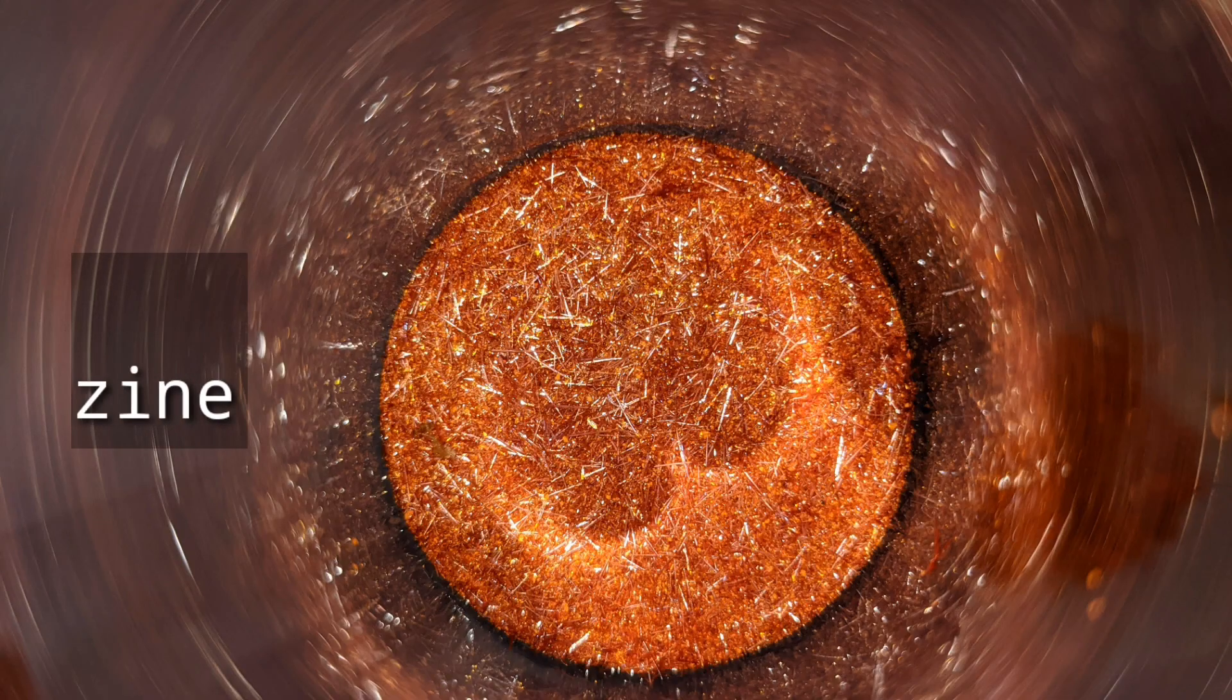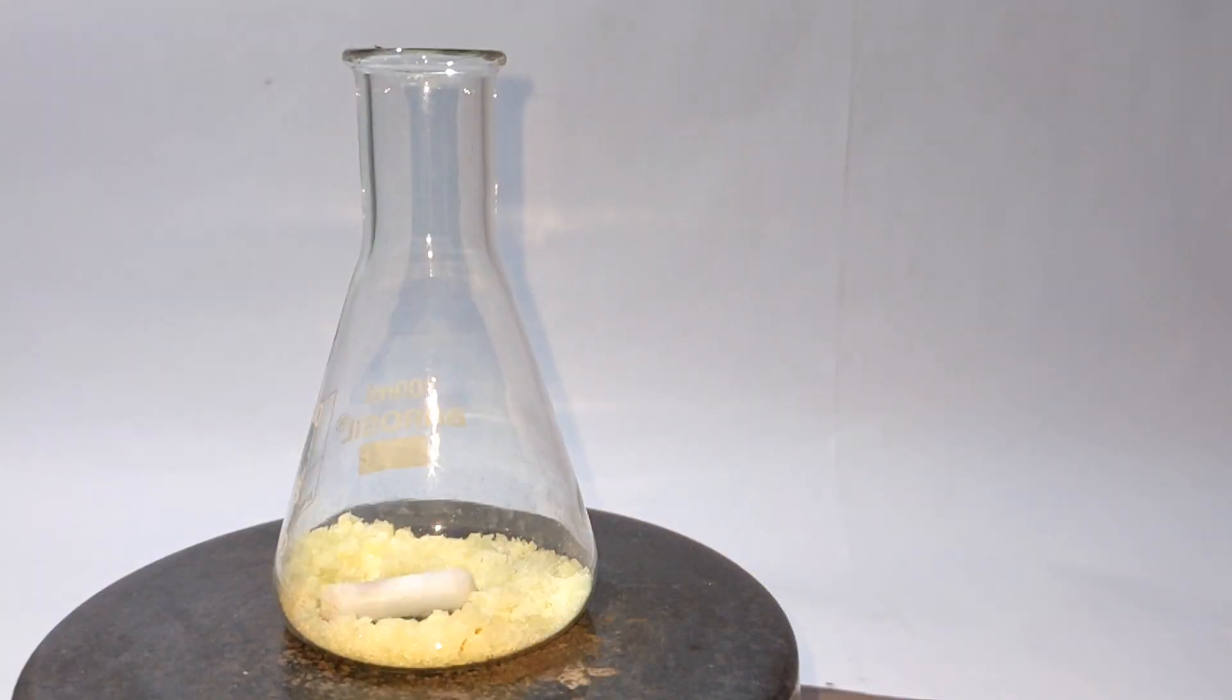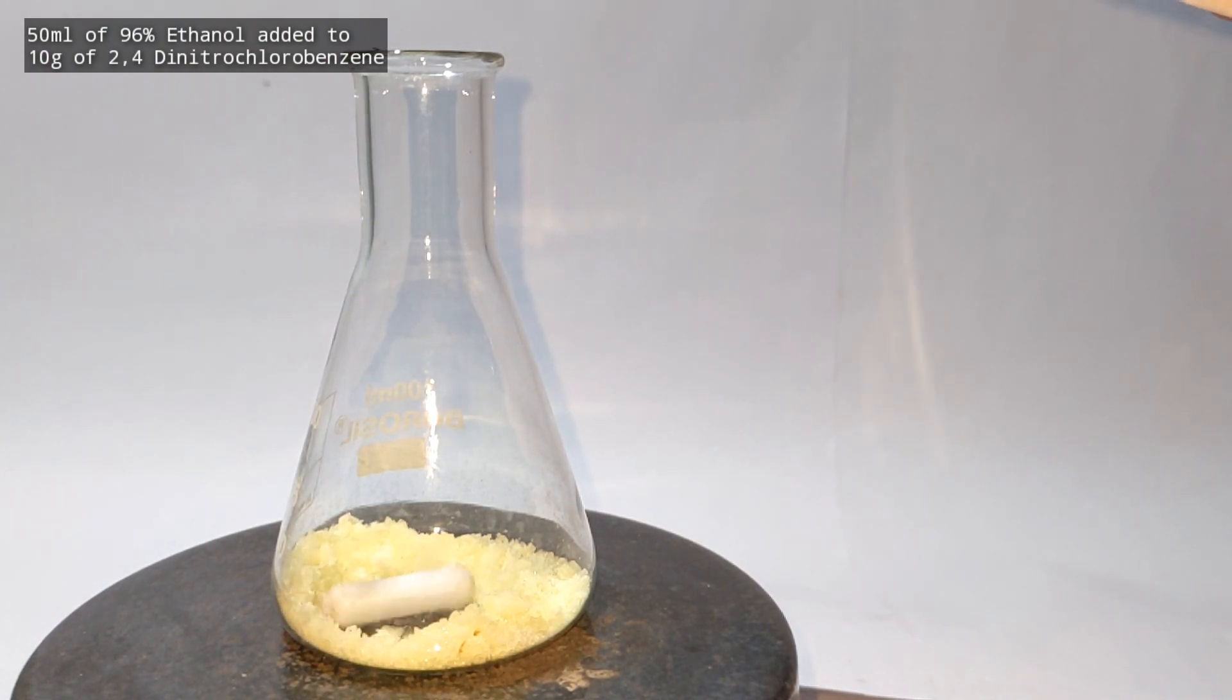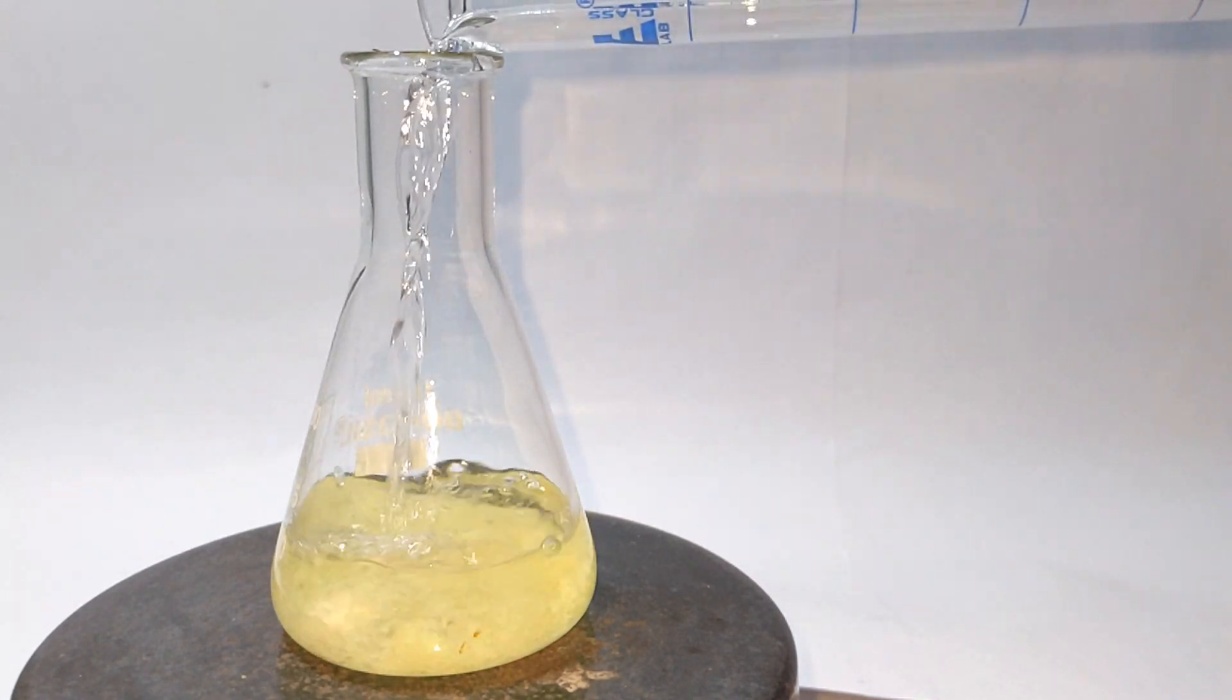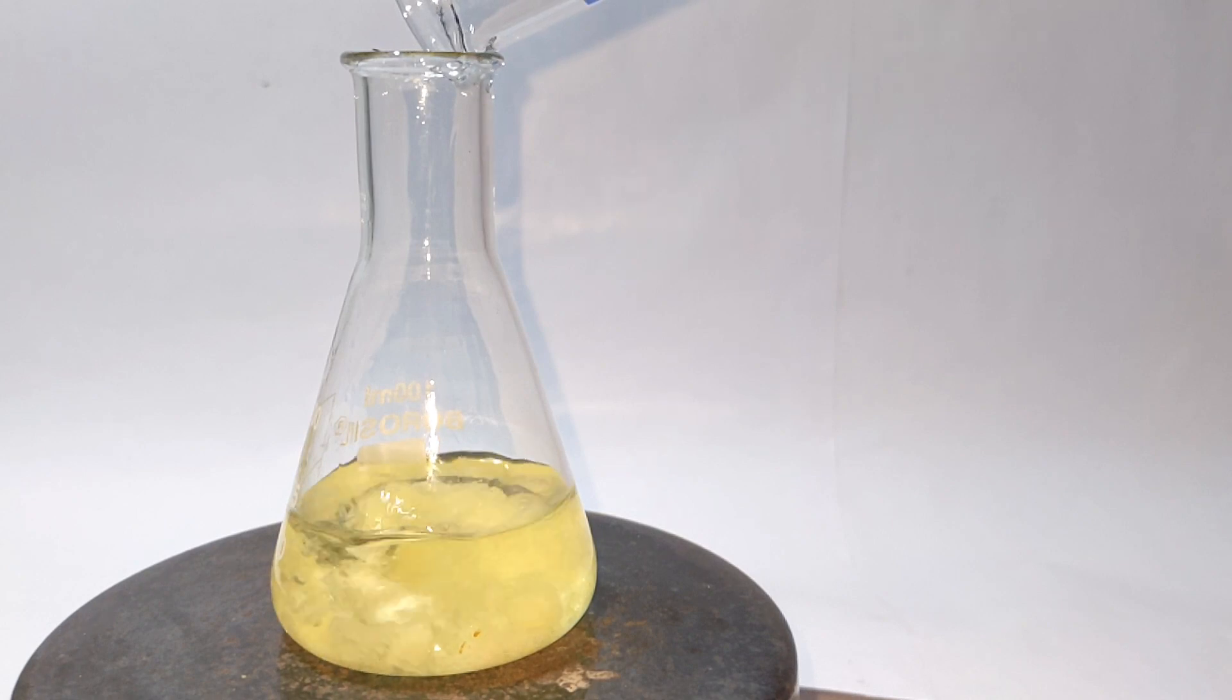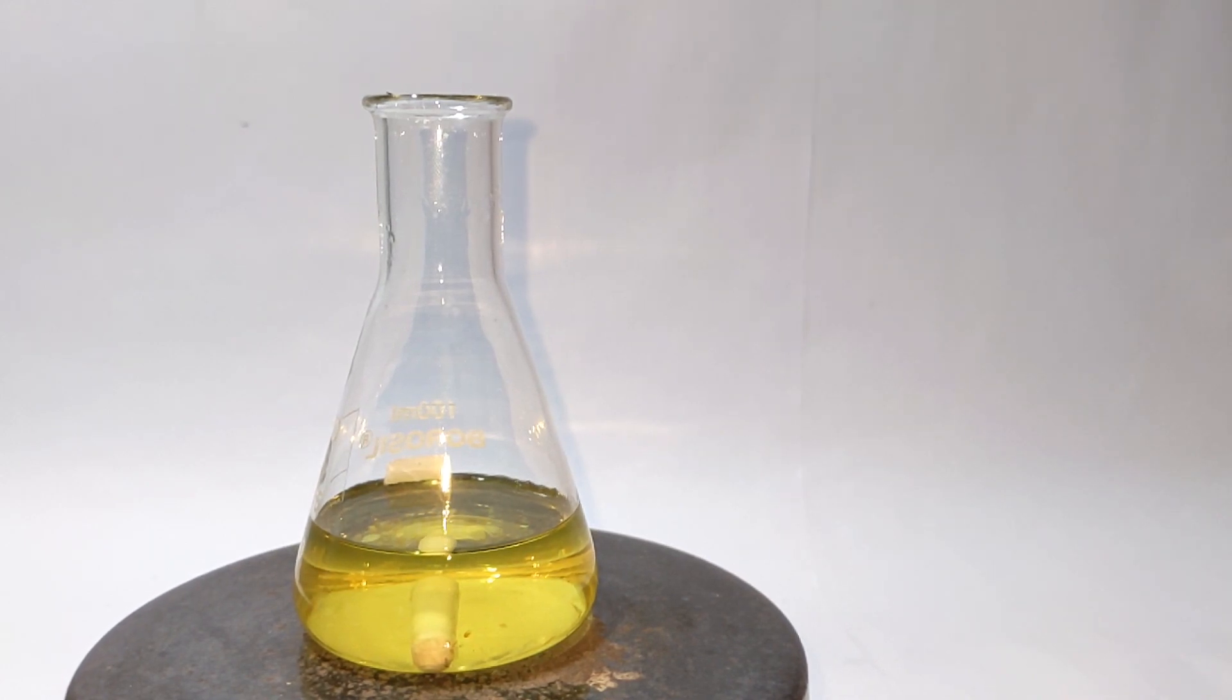Moving on to the synthesis of 2,4-dinitrophenylhydrazine. For that, 10 grams of 2,4-dinitrochlorobenzene was taken in a 100 milliliter Erlenmeyer flask then with stirring added 50 milliliters of 96% ethyl alcohol. With gentle heating and stirring everything dissolved and the solution turned clear yellow in color.